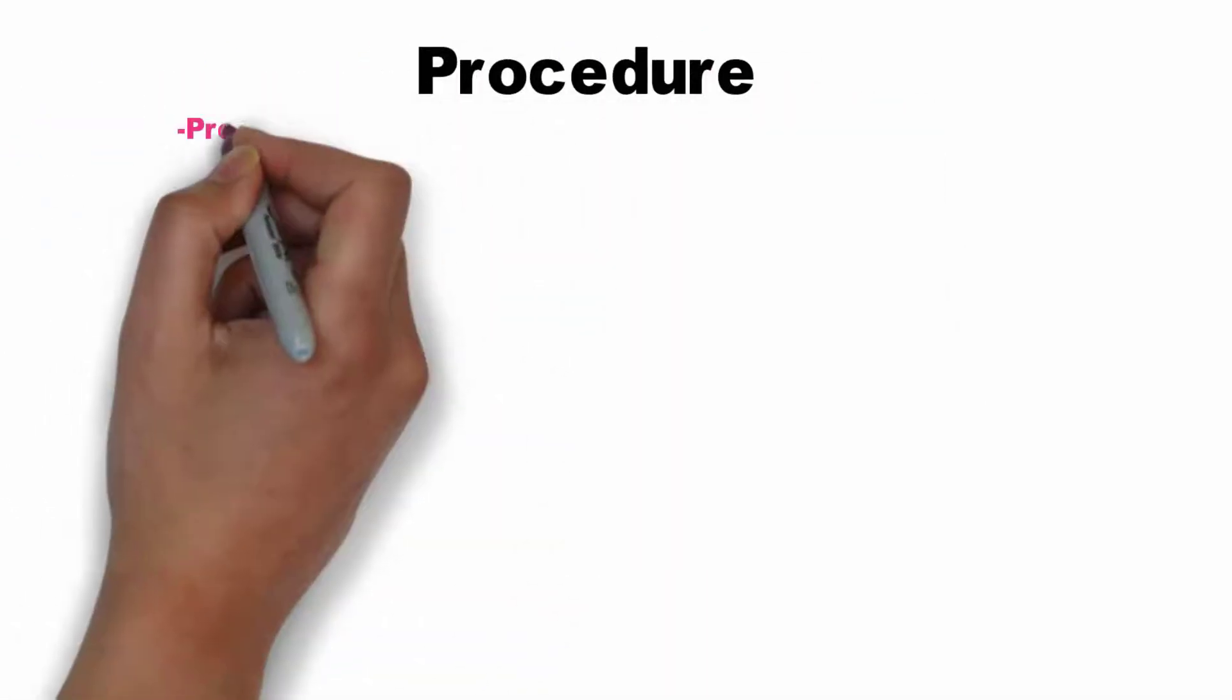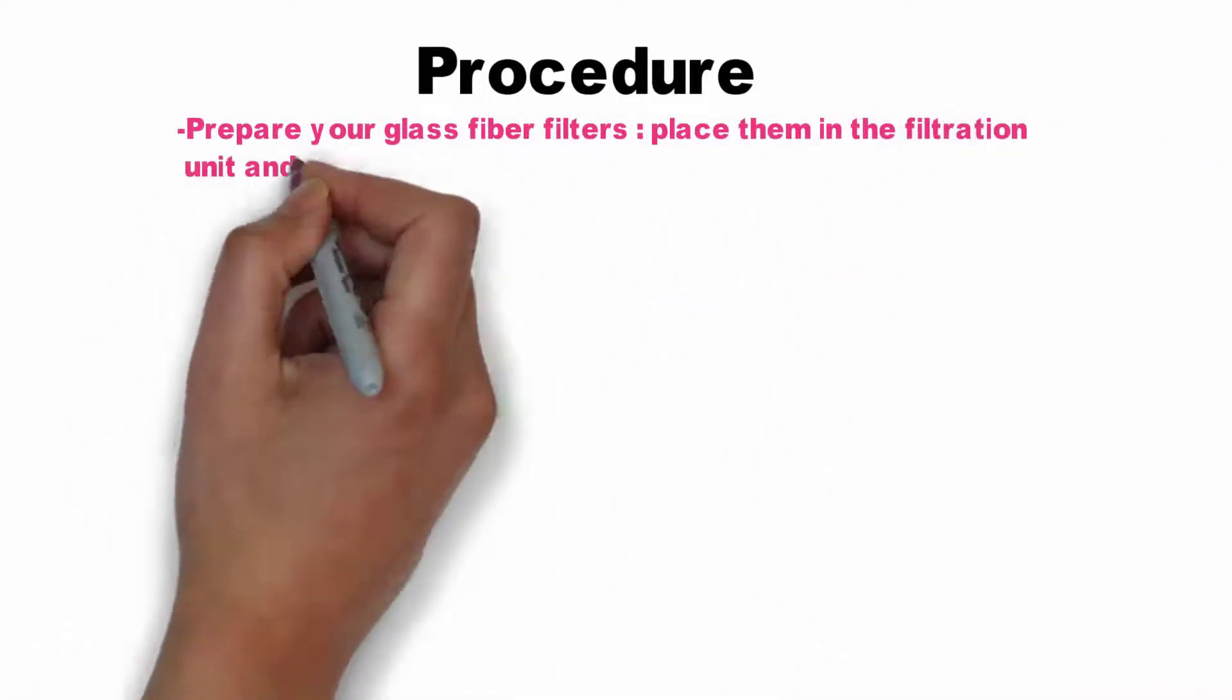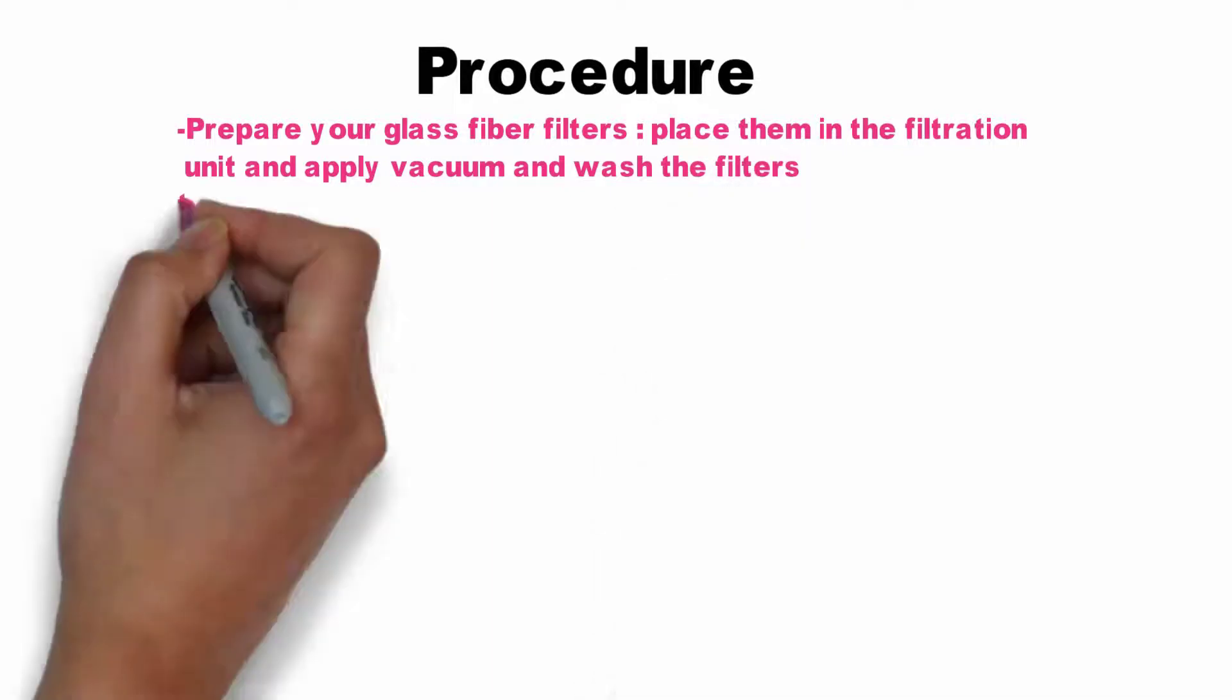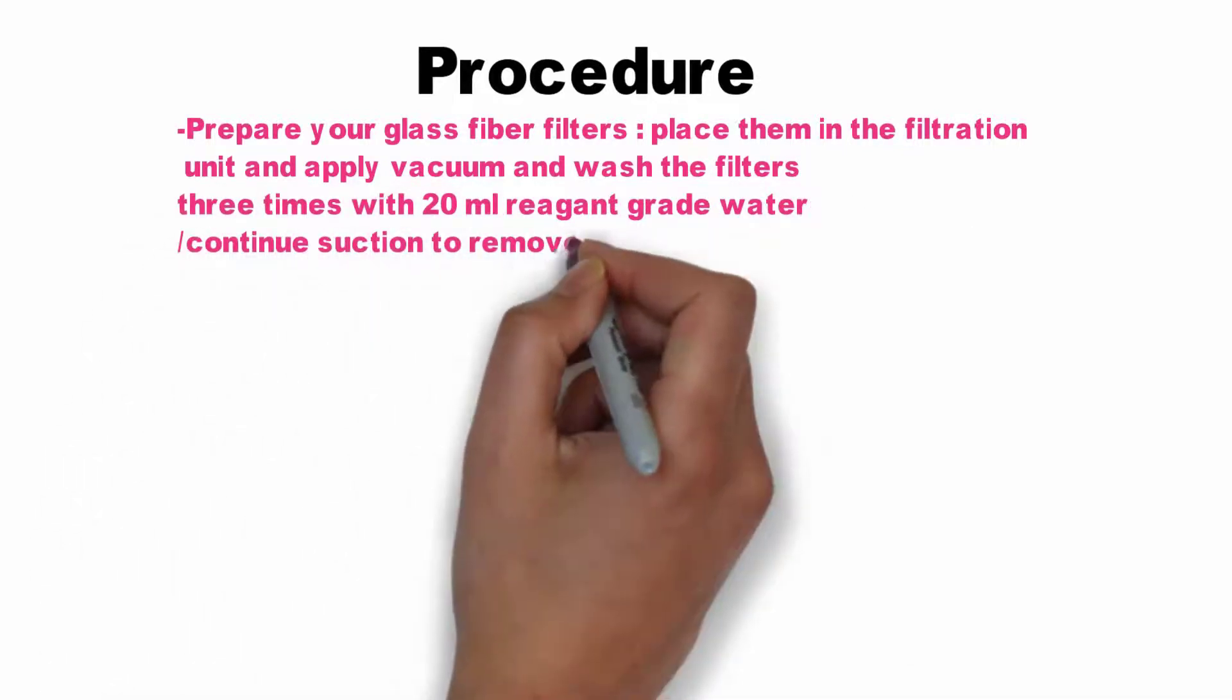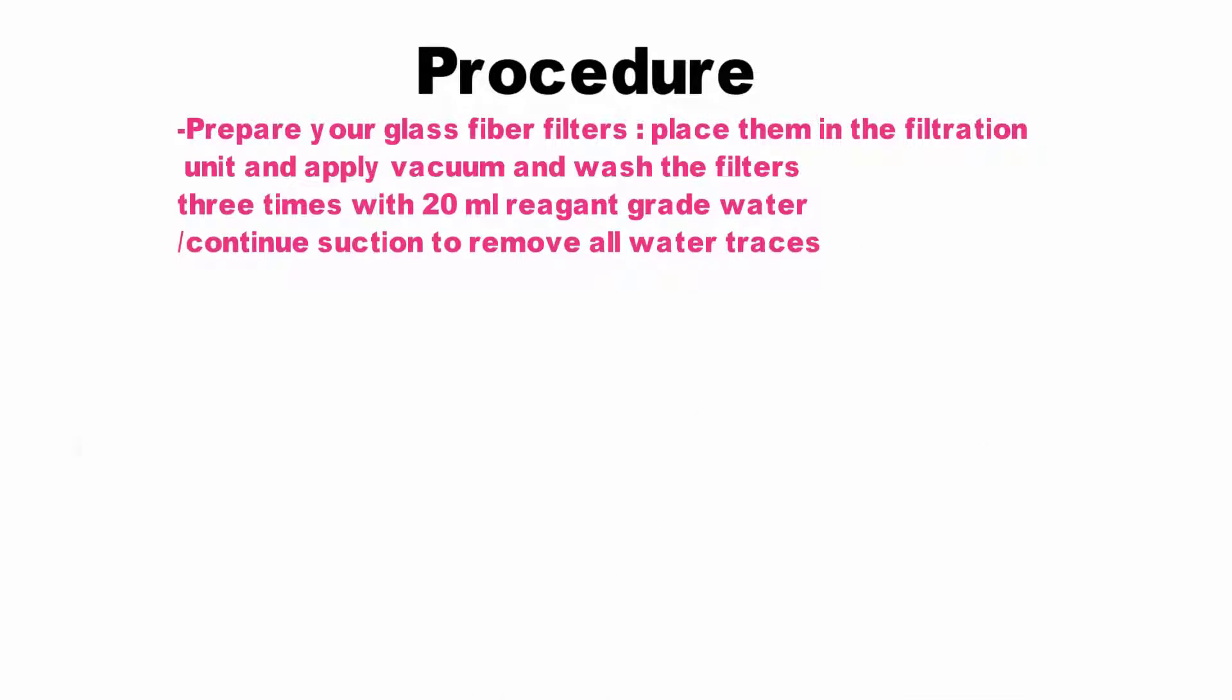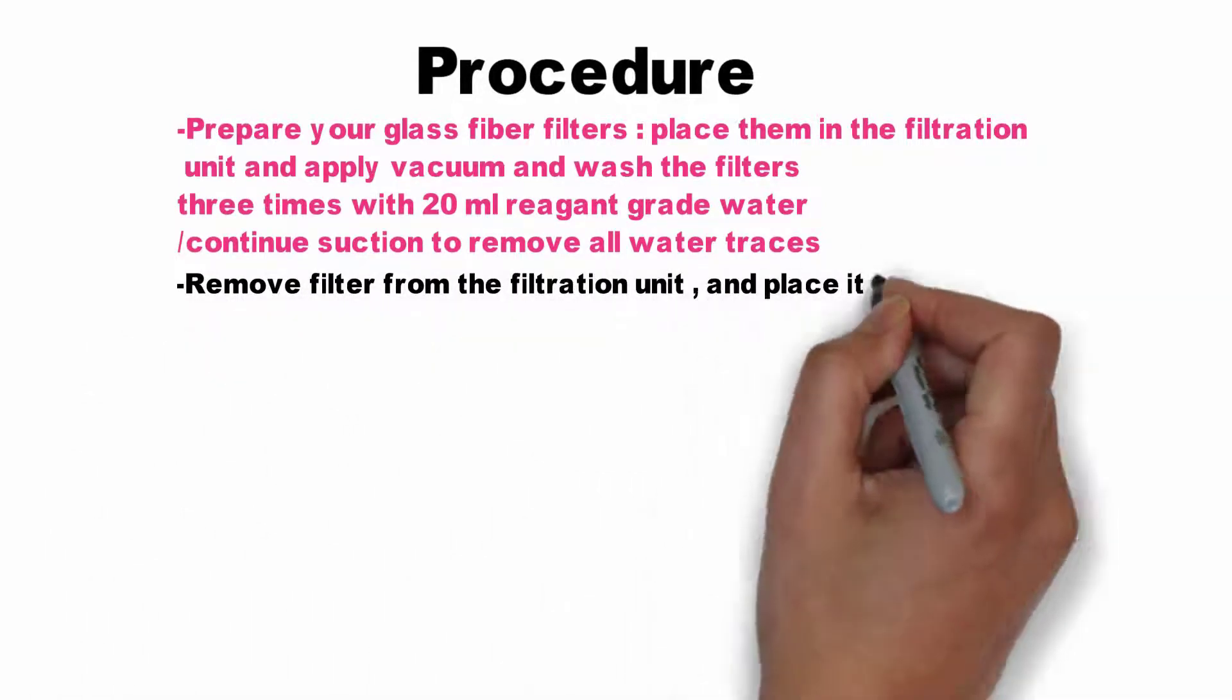Now to the procedure: Prepare your glass fiber filters, place them in the filtration unit and apply vacuum, and wash the filters three times with 20 milliliters reagent grade water. Continue suction to remove all water traces. Next, remove the filter from the filtration unit.